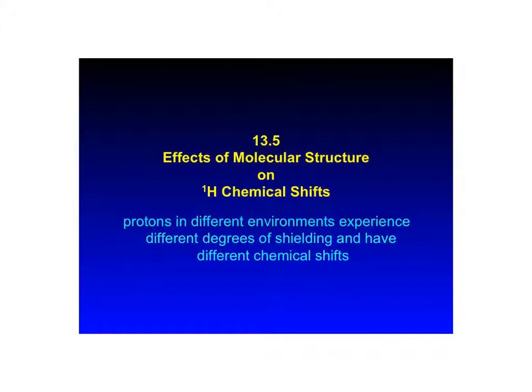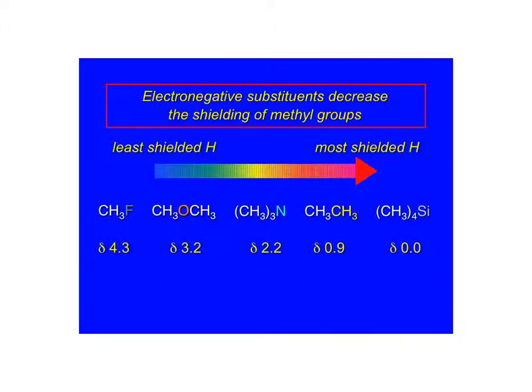All right, so that's easily said and done if we only have 1 type of hydrogen. But what happens when you have multiple types of hydrogen and they're in lots of different environments? What kind of effects will that have on the spectrum? And how is that useful for NMR, or for determining the structure?